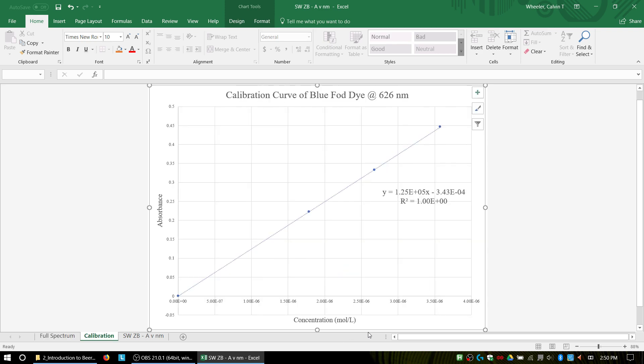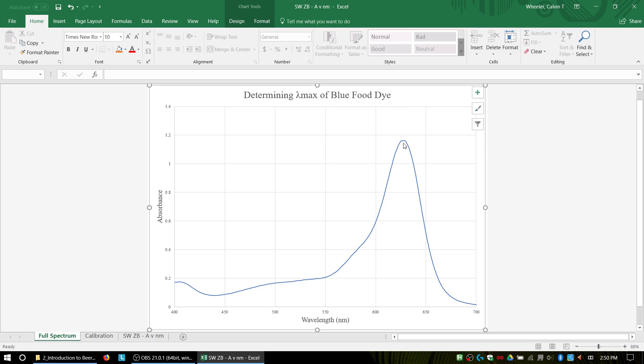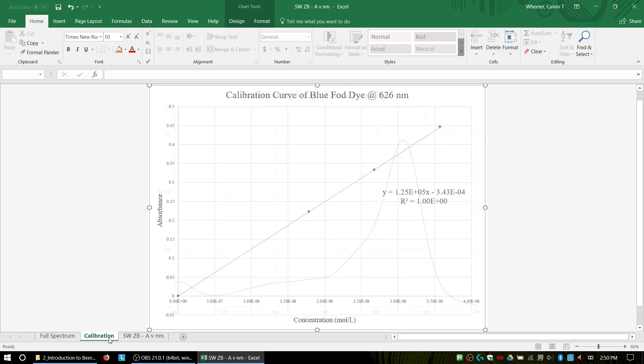And everything looks good. So now I have two solid graphs to submit. I have my full spectrum graph, which shows my lambda max, which you could label because you found that graph using Logger Pro or your LabQuest. And then this, the regression line was calculated for you. So that's it. I hope this was helpful.